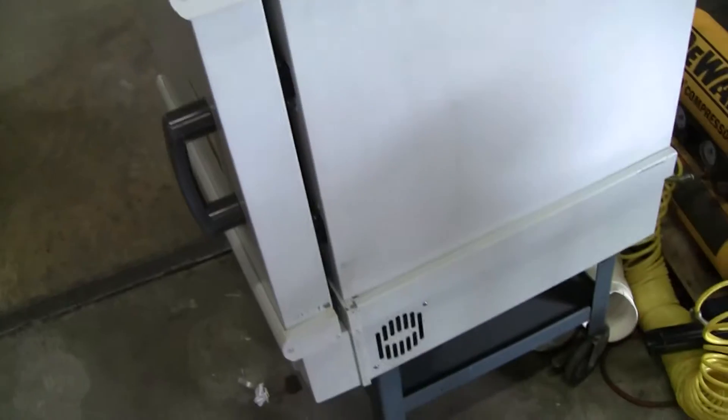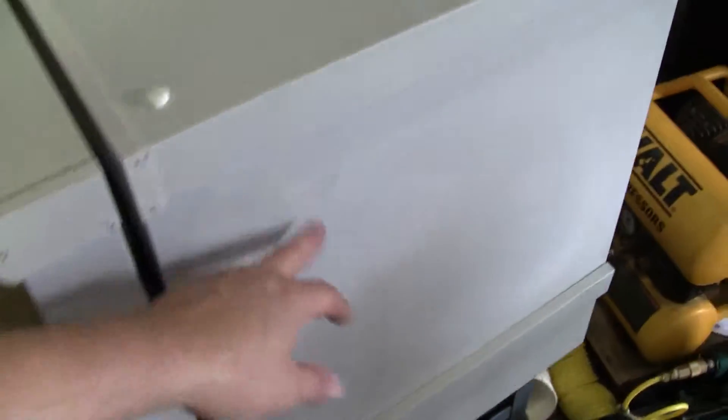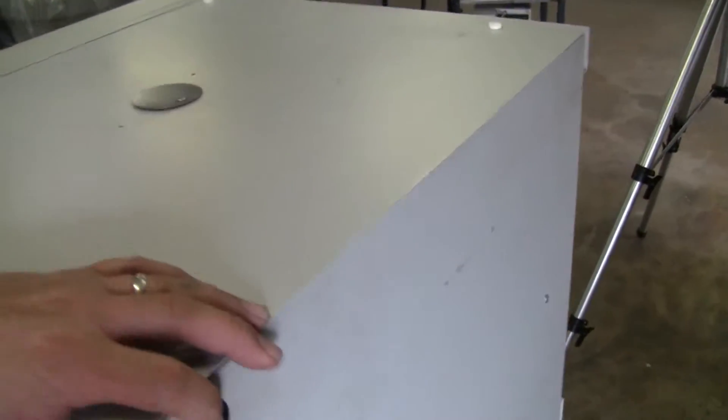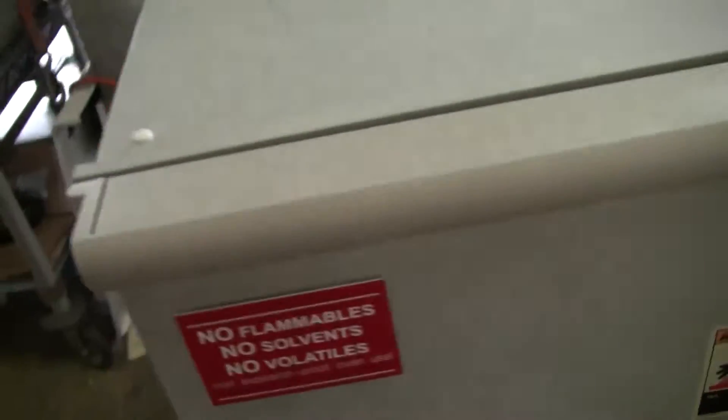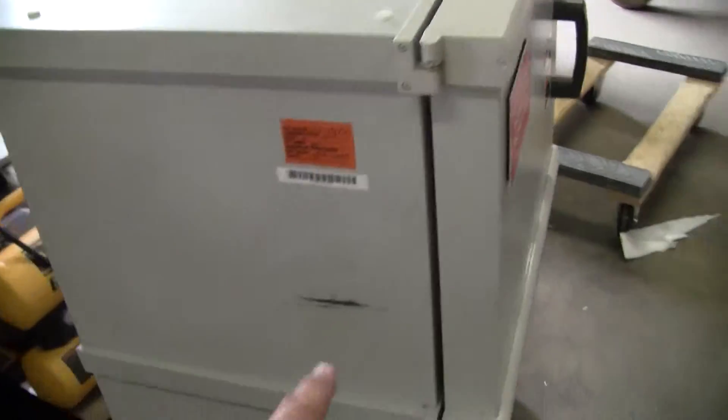This unit has seen some use — you've got your normal used-equipment scratches. This runs on 115 volts on a 20 amp circuit. Your top lid will rotate on, rotate off, depending on if you want to vent it. Typical scratch on the side.